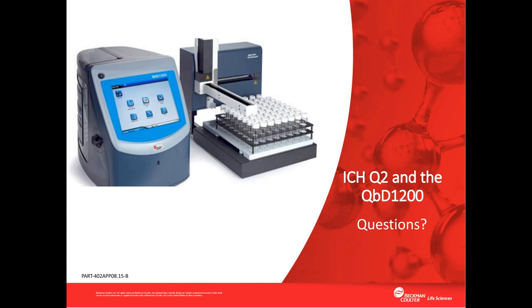Our first question, you mentioned 21 CFR Part 11 data integrity. Could you please explain again how manual error can lead to data integrity challenges?